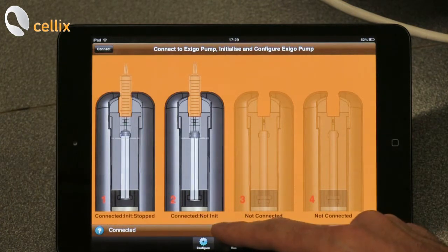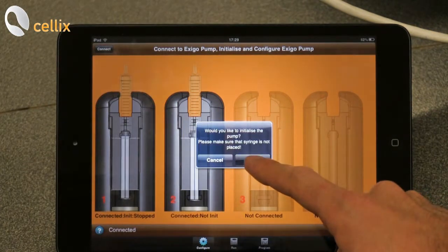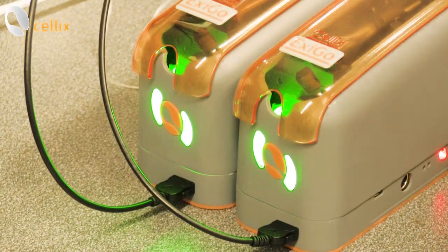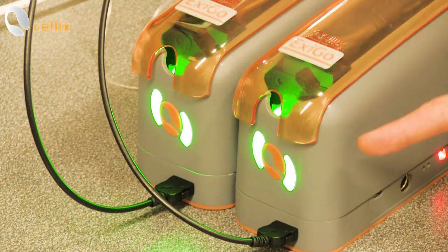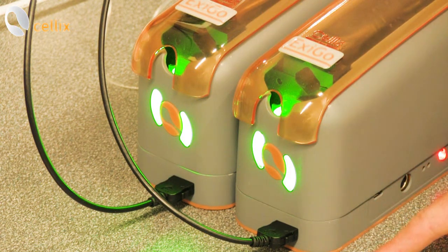We do the same operation for pump number two: double click, initialize. We can see the green lights in front of the pumps — this means that the pumps have been correctly initialized.